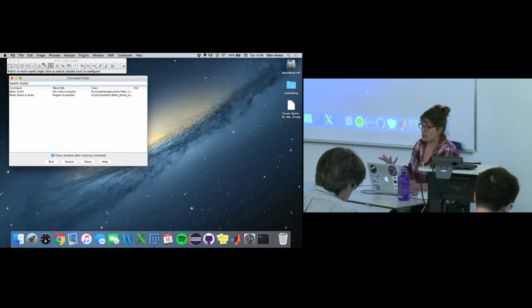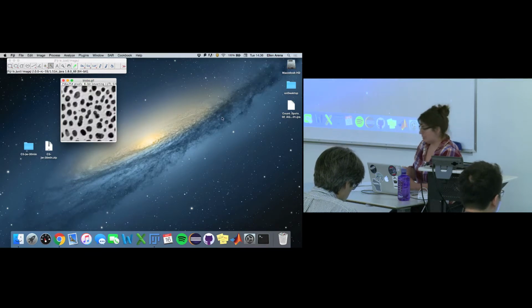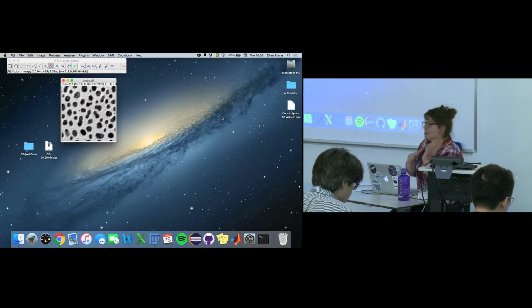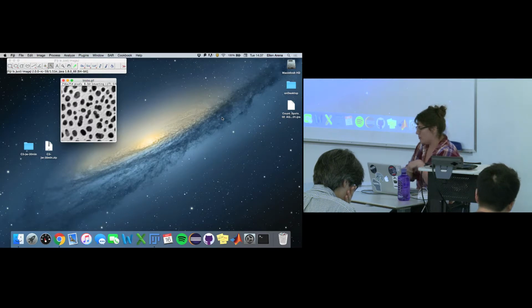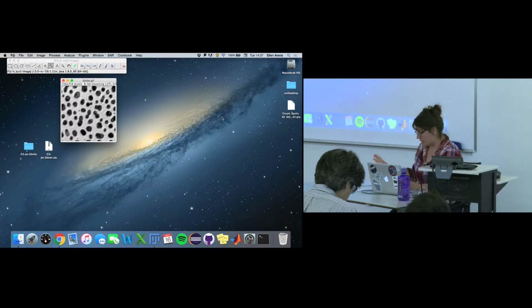So when I say thresholding, you guys have a general idea what I mean? Essentially, thresholding is one of the most common tasks you'll do in most cases when you're analyzing your images. Basically what you want to do is separate out objects of interest from background, for example. So like cells, not cells, foreground, background. So essentially you're setting a cutoff, okay, between these two things.